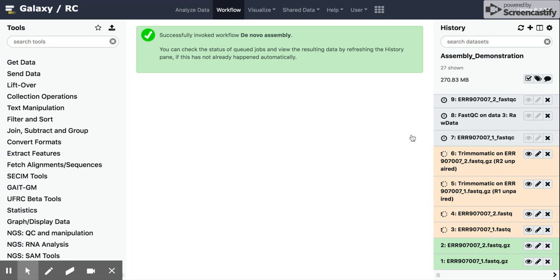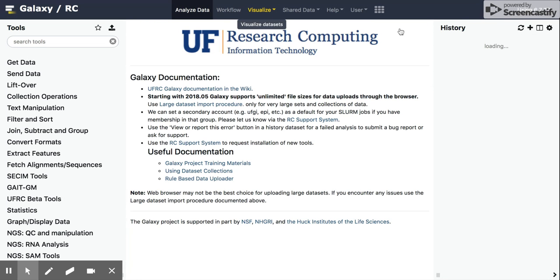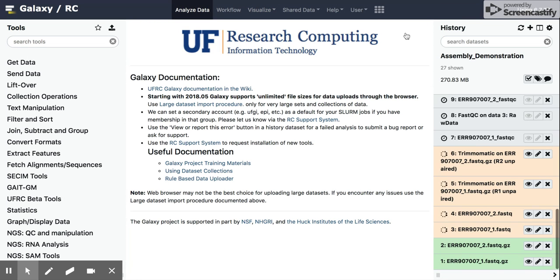So when we come back, we'll come back to this, but a couple quick other notes, you can leave this workflow now, you can go do other things. We can go edit our workflows, we can go view another workflow, and this will all run in the background.